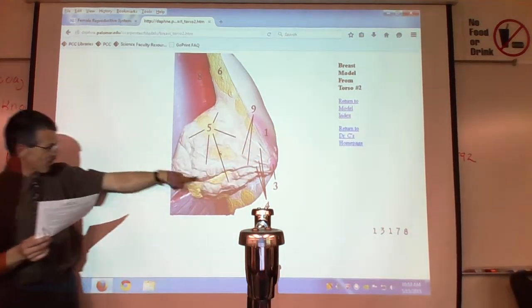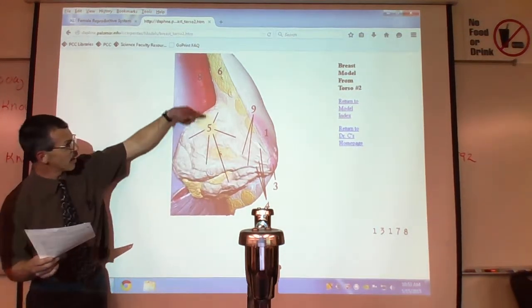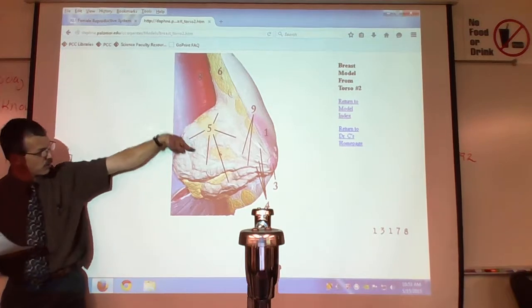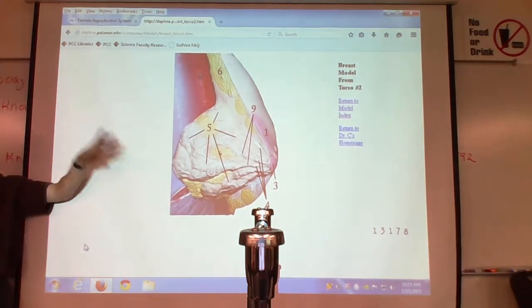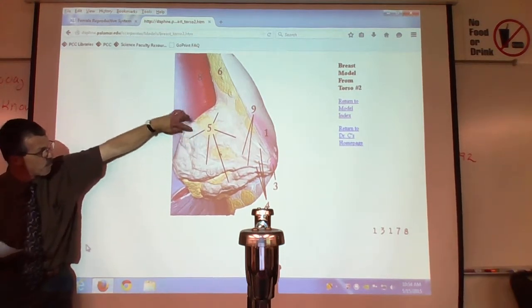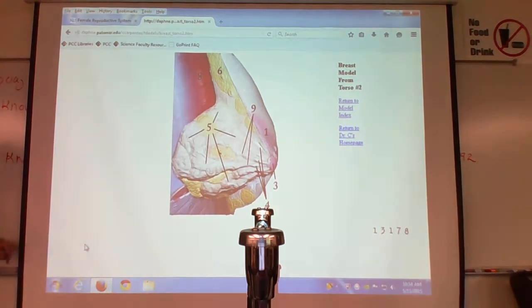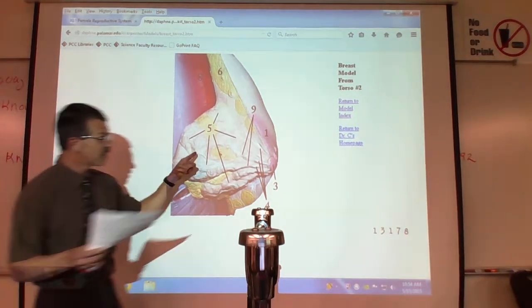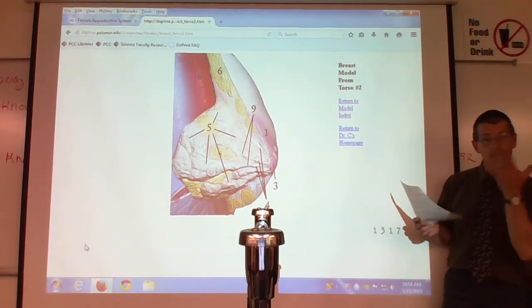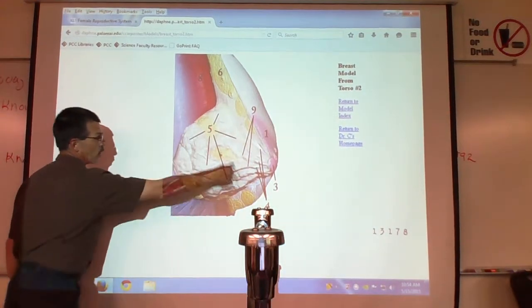Now we have problems. These things are the mammary glands, but they don't call them that. The big chunks, where each part is, that's a lobe. Here I see 3 lobes in this mammary gland. If you notice, each lobe has regions in it. What do you call regions of a lobe? Lobules. Each round dot, that's a gland, but we don't call them that. They look like air sacs. Alveoli. So each circle is an alveolus, living in a lobule in a lobe.